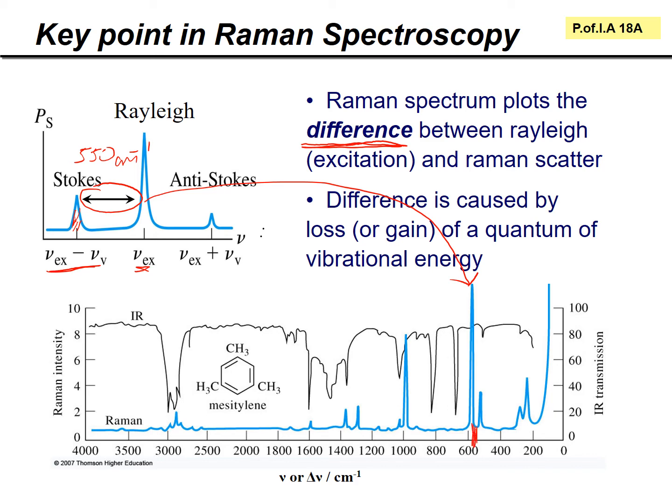That's that value there. Now, there will be some more Stokes photons further out here, and these will be scattered more. Maybe that's about 1,000 wave numbers now is the difference between these photons and the incident photons. This lot are then plotted here, and so on.